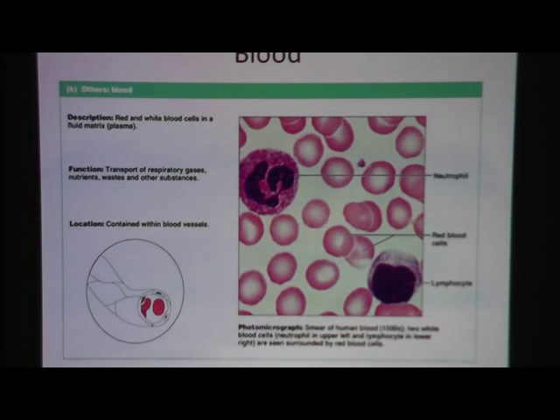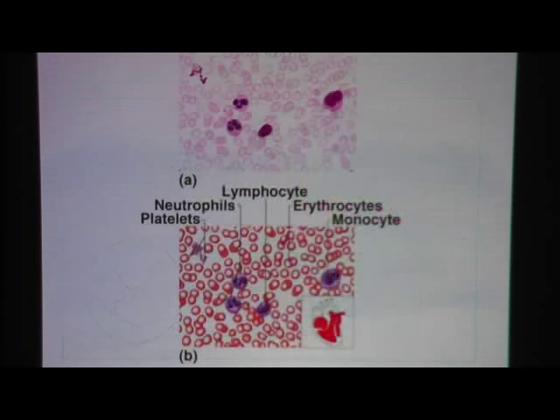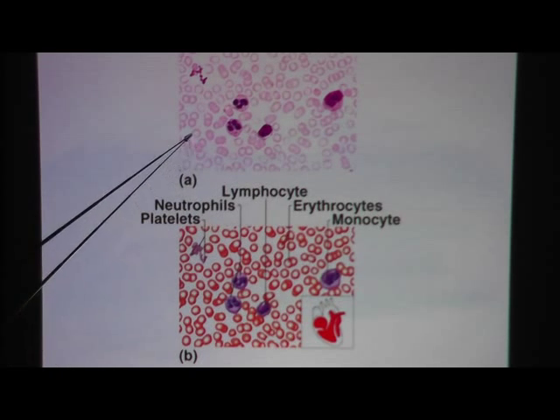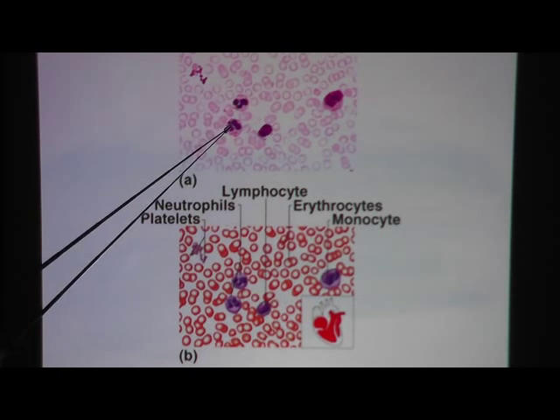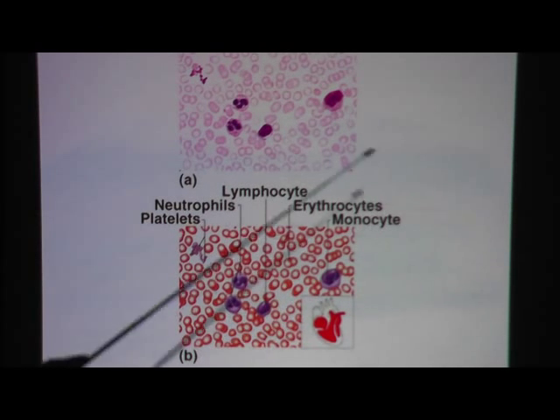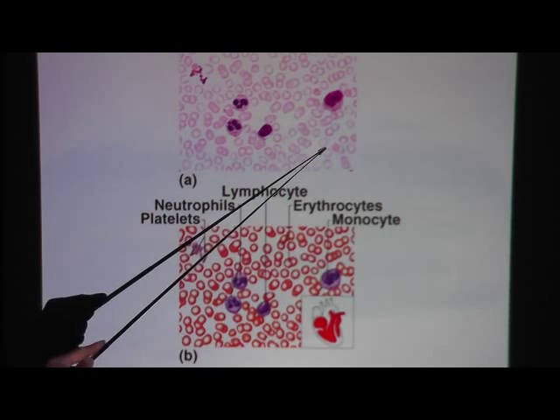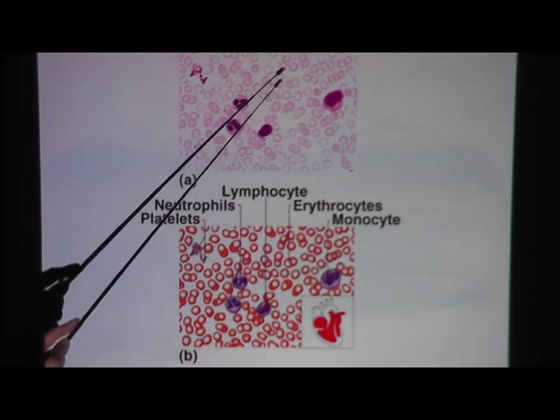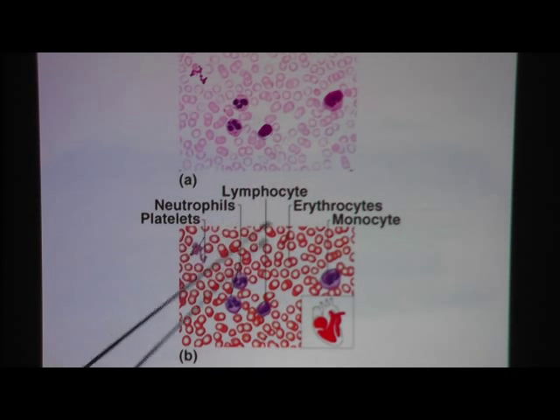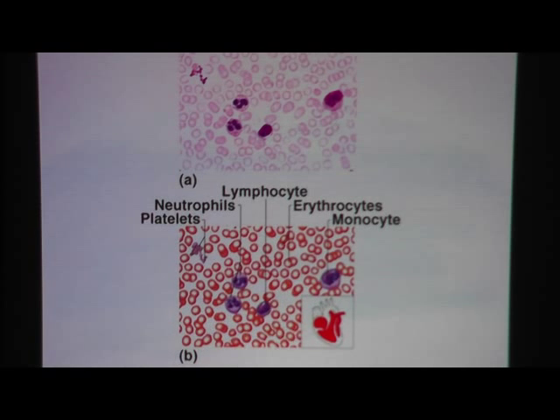Platelets are the stuff to help you clot. Here is low power. Most of these are red blood cells. Here we have a couple of white blood cells — they stand out like a sore thumb. The space in between is blood plasma. Don't worry about the specific names of these cells; just know them as red cells or white cells. That's good enough.